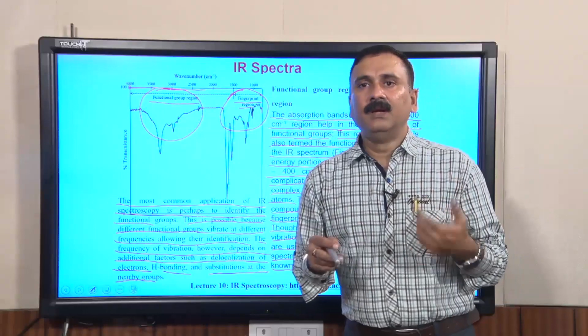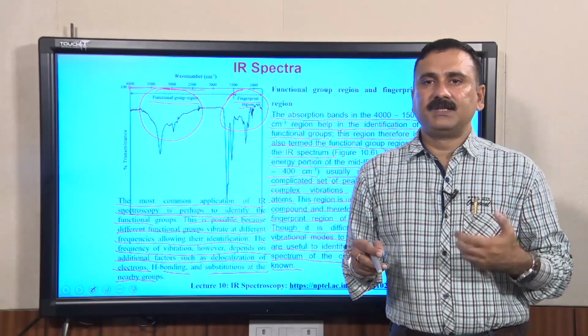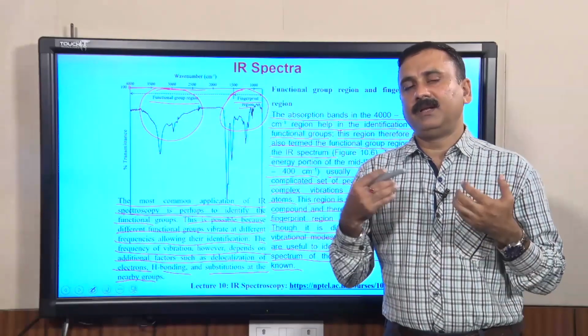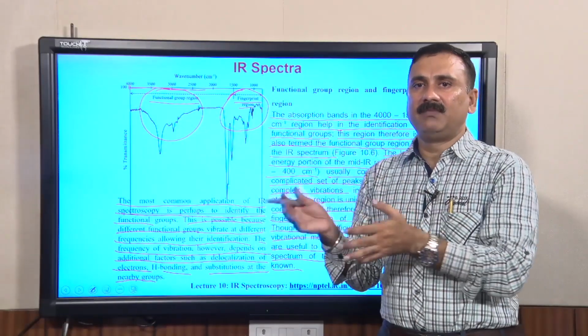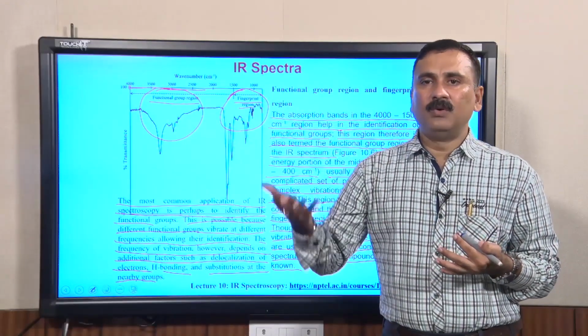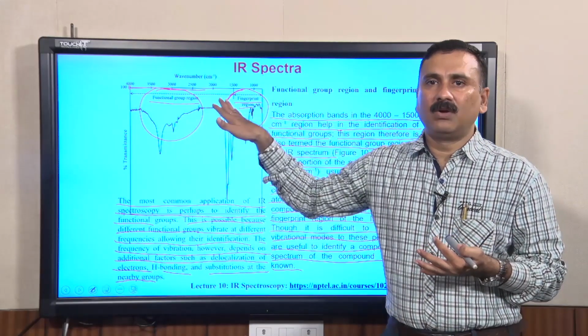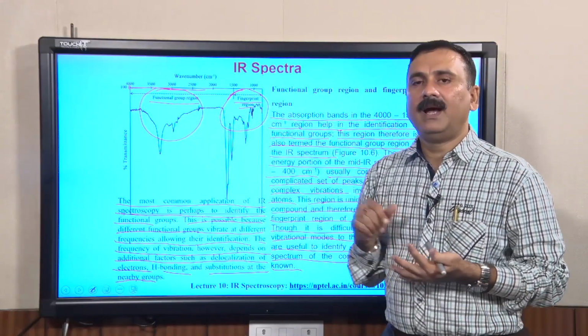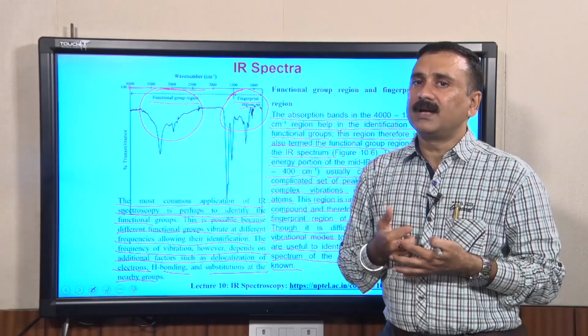As I said, no single technique is complete on its own, and that is why it is important that you use multiple techniques. So, if you have the already known IR spectrum of a particular molecule, then you can assign these peaks and characterize the compound.